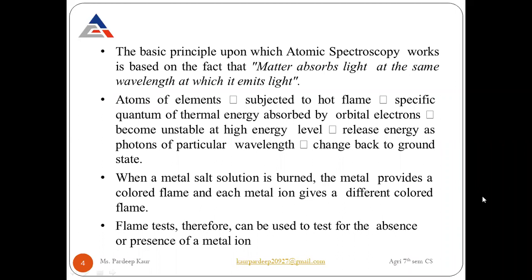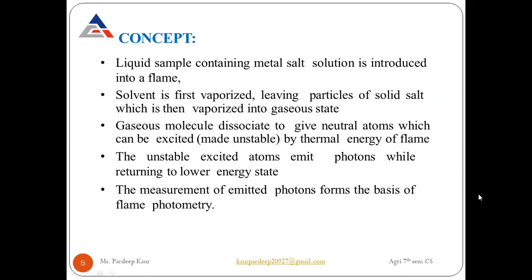Next is the concept of flame photometer. In the concept, a liquid sample containing metal salt solution is introduced into flame. The solvent dissolved in that liquid sample is first vaporized, leaving particles of solid salt, which is then vaporized into gaseous state.